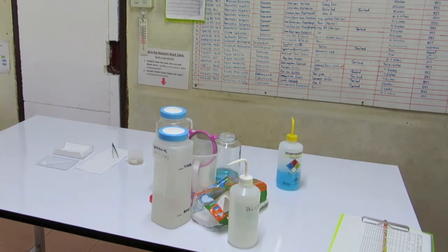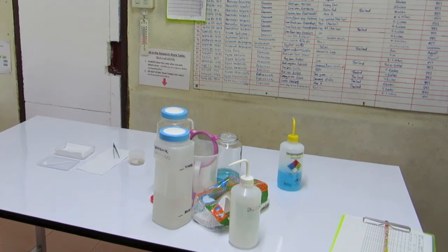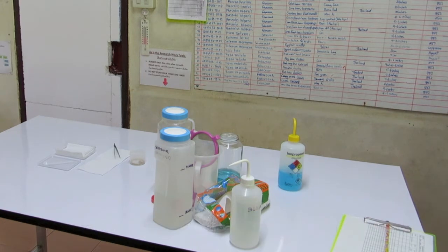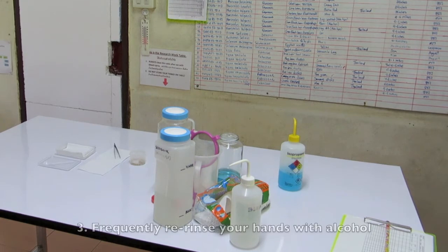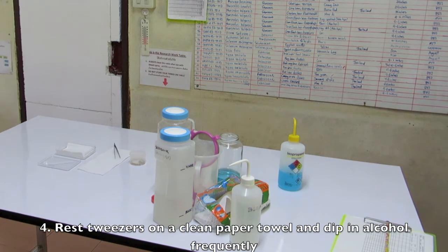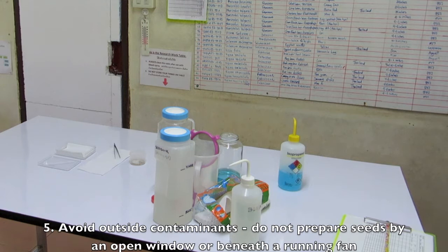Things not to do: Never touch the seeds with your bare hands. Always use sterile tweezers or forceps. You may use your cleaned bare hands to touch the outside surfaces of the petri dish, but never touch the inside. If you find you have to touch or move something outside of the sterilized workspace, re-rinse your hands with alcohol after doing so and before touching your tools again. Never let your tweezers or forceps touch the workspace. Rest them on a clean paper towel and dip them in sterile water or alcohol when moving between multiple petri dishes. To avoid outside contaminants, do not prepare materials or seeds before an open window or beneath a fan.